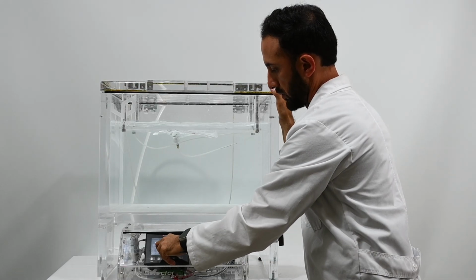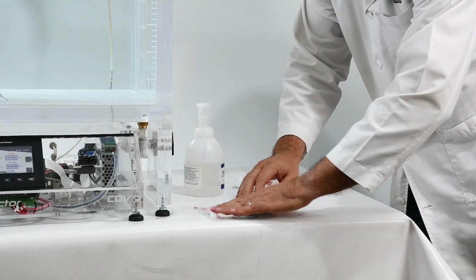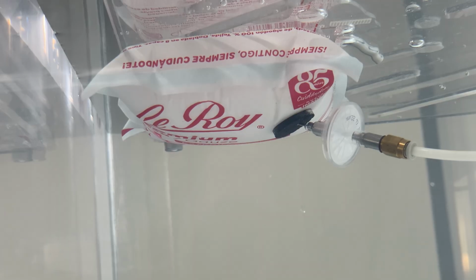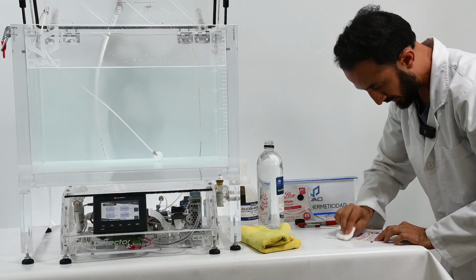In summary, if your test pressure exceeds the breathing pressure of Tyvek, use hand sanitizer foam so that what you see are real leaks, and if that doesn't work, try using glycerin.